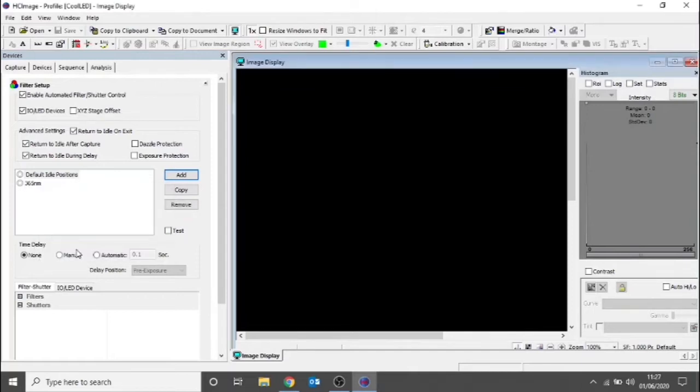In the pE-300 series, there are three available wavelengths: 365 nanometers, 460 nanometers, and a broad GYR covering approximately 500 to 650 nanometers. All wavelengths can be set up individually, and the intensity required can be chosen and selected below. In this case, we're going to just use the 365 nanometers.